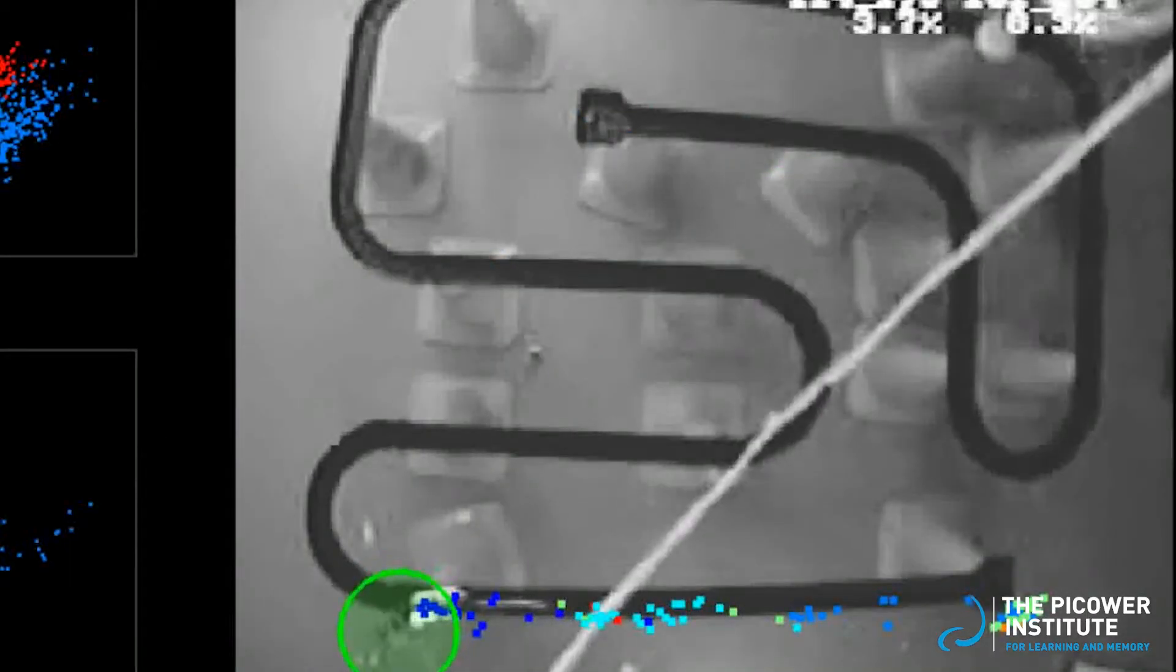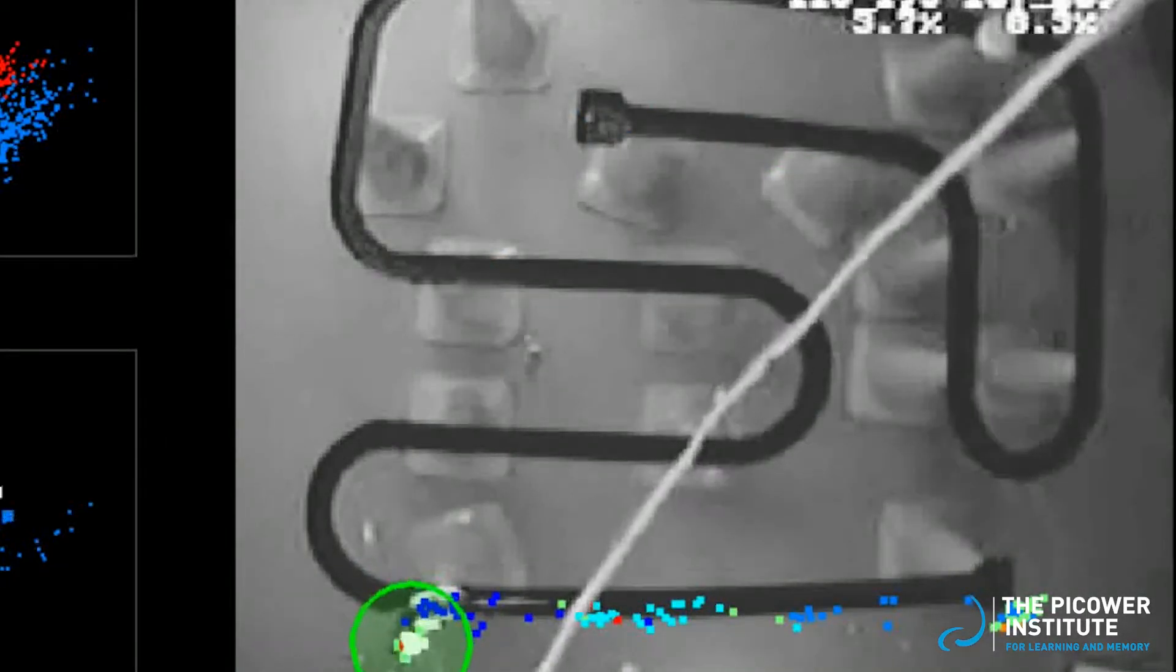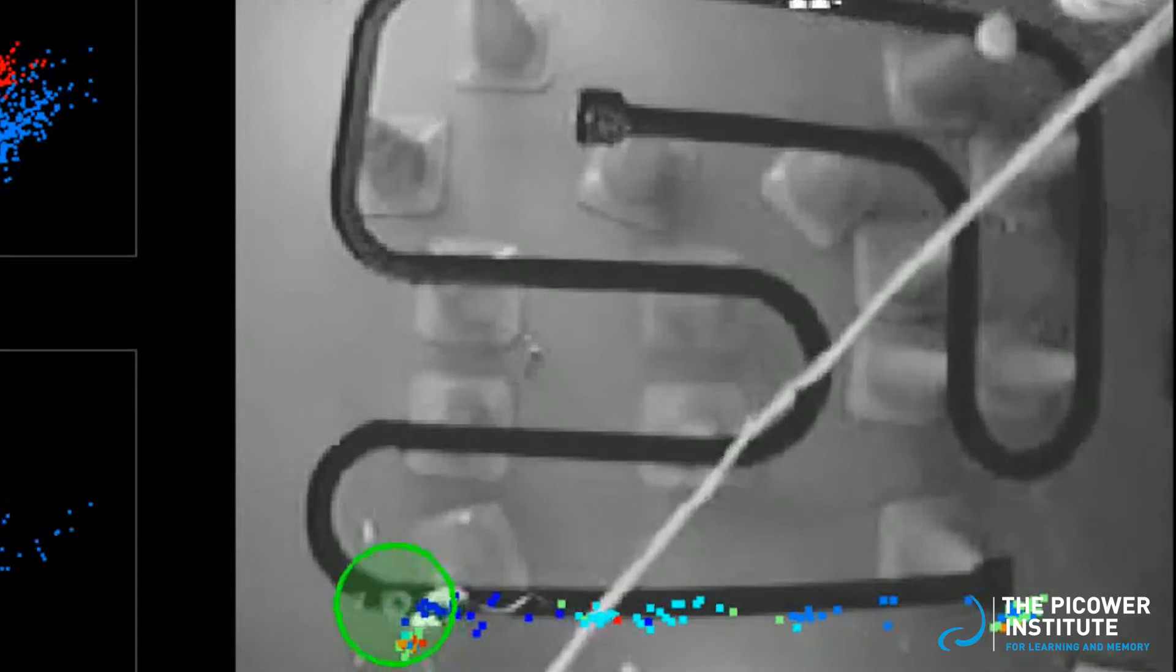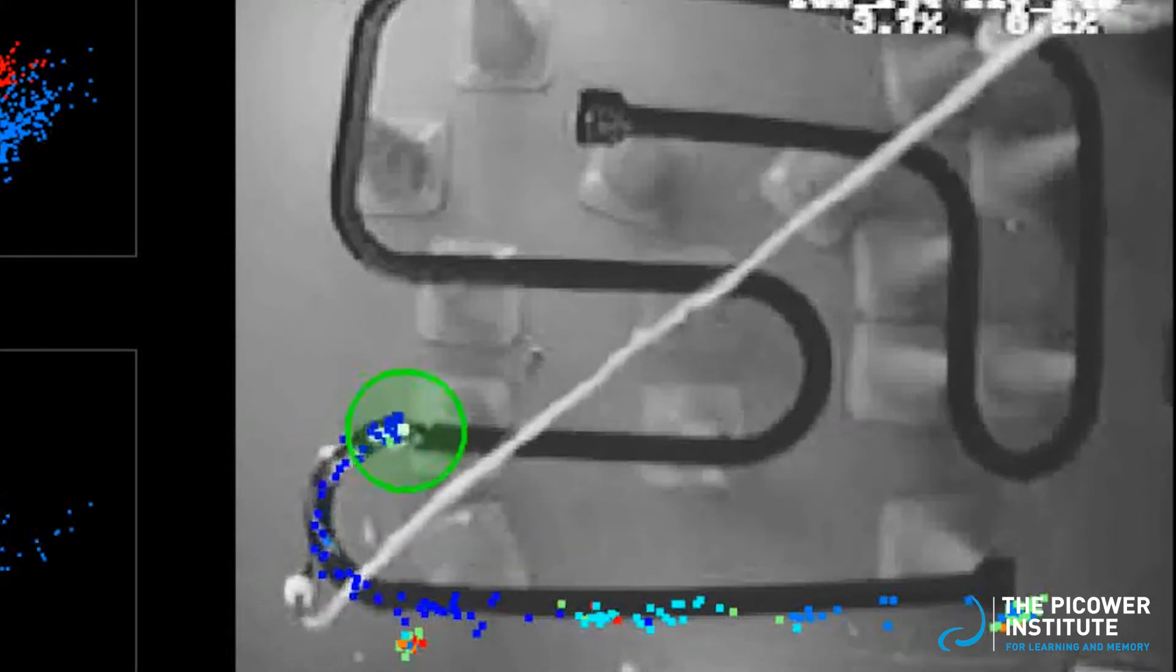At this early part in the track, you see a cluster of green cells at the very beginning, followed by lighter blue cells, and then a darker blue cell around the first bend.